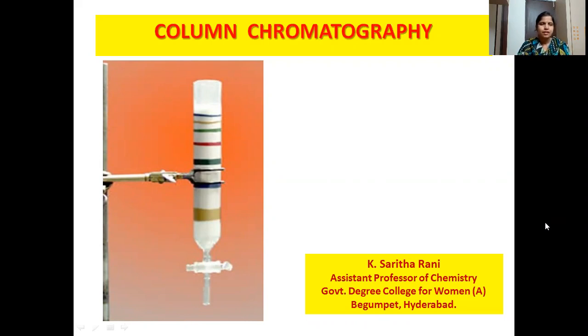So in our previous classes, we have seen the introduction of chromatography and two techniques of chromatography. Those were TLC, that is thin layer chromatography, and paper chromatography. Now today, let us discuss column chromatography.